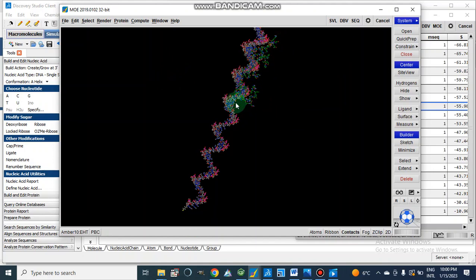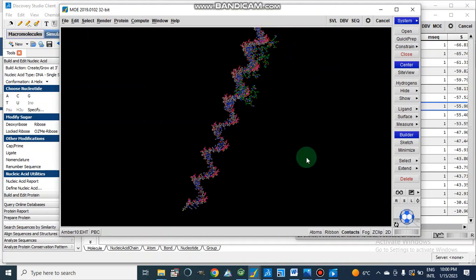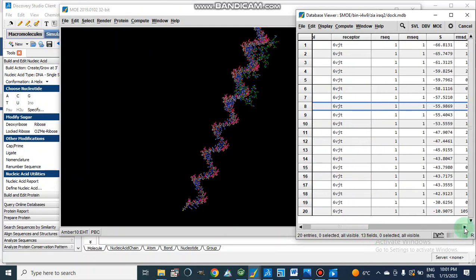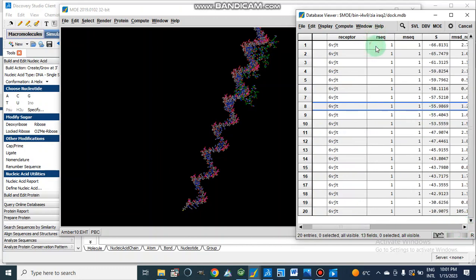Here I have already run the docking of this protein and DNA. The DNA was made the ligand and the protein contains residues that interact with that ligand in different regions. These regions are represented with energy values showing where the interaction is most suitable. For example, the first region has an energy value of minus 66.81 kilocalories per mole, and other poses give values of minus 65 and minus 61.